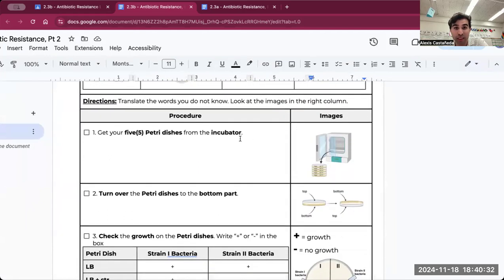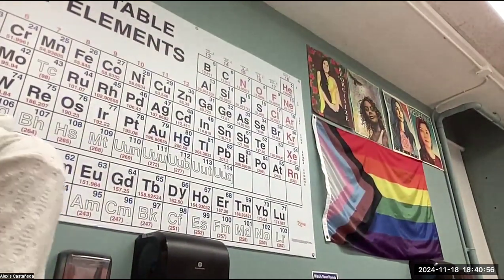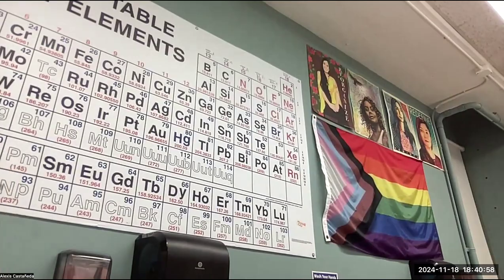So we're going to grab our bacteria from the incubator, and we will check them out. So moving over to the incubator, we're going to look at our samples and see if we got anything interesting. We should have our plates, the 4 plates that we set up the other day, and we should also have our mating plate. And it looks like we are right on the dot.